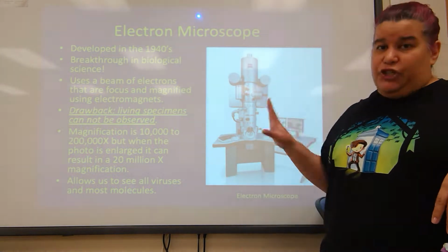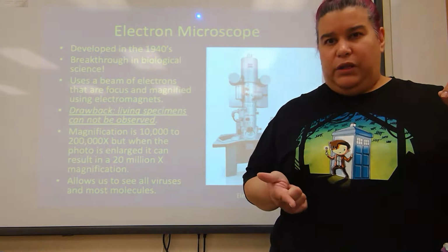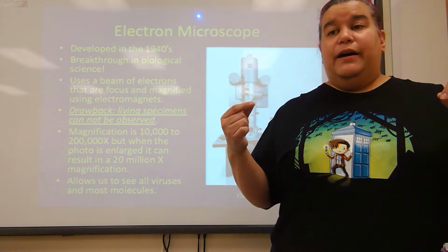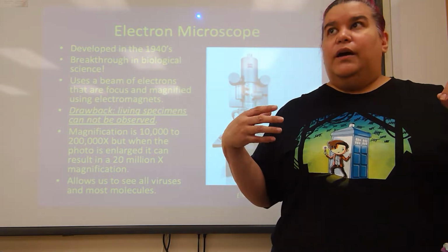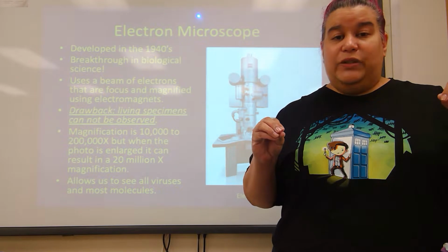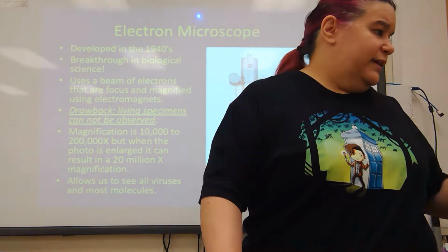This machine actually allows us to see all viruses and most molecules. So not necessarily individual atoms, but we might be able to see a sugar crystal or caffeine or chocolate. Okay, so it allows us to actually see the molecules themselves. All right.